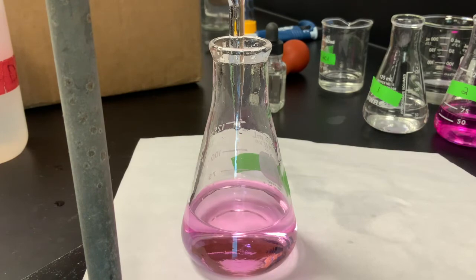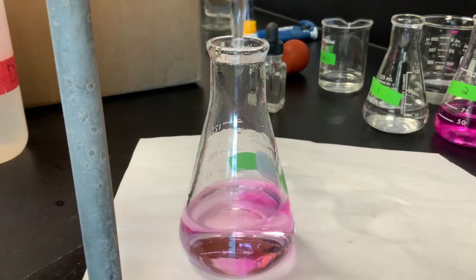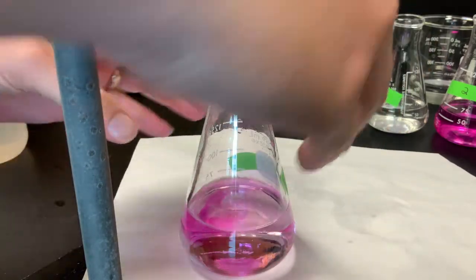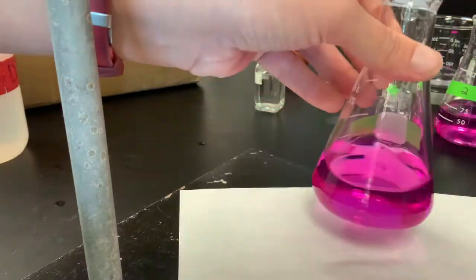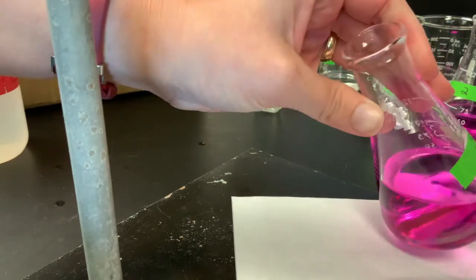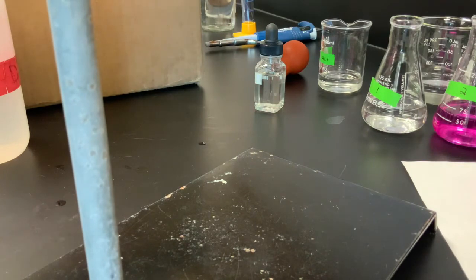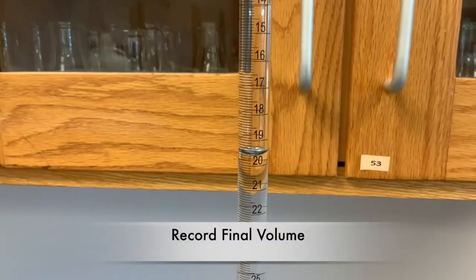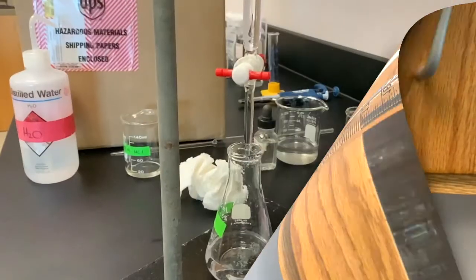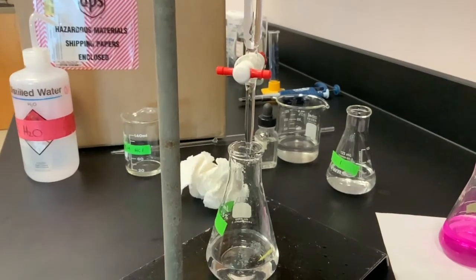which is good. We want it as pale pink as possible. Unfortunately, it got a little bit of extra. There was a drop that got in there. We're going to try one more trial just to get another very pale pink, even though that one was pretty close. So again, we want to go ahead and record our volume. A little bit of consistency with our measurements. We want to have at least one more pale pink.